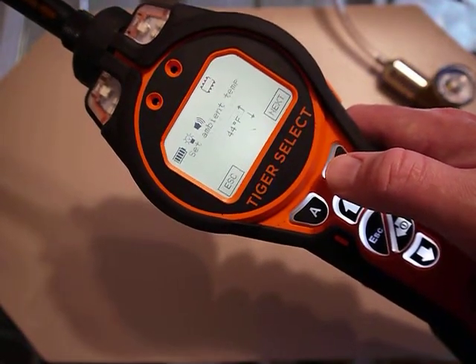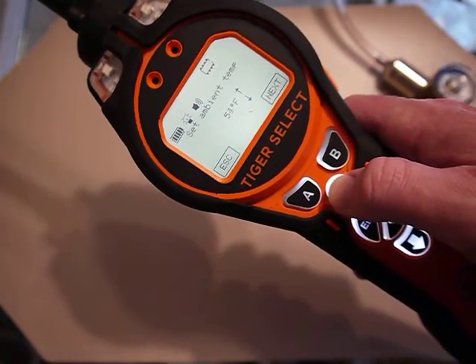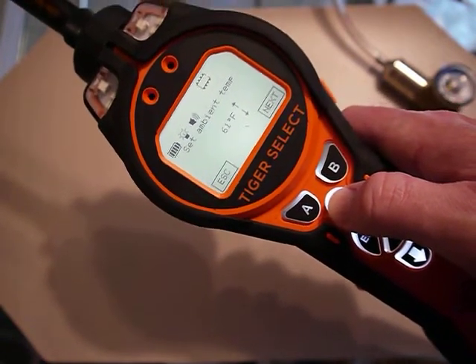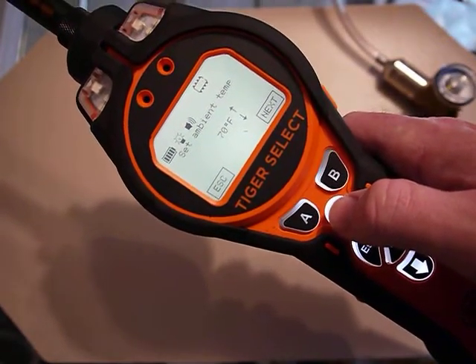I put in the temperature — I know it's about 70 degrees Fahrenheit, which is about 21 degrees Celsius.